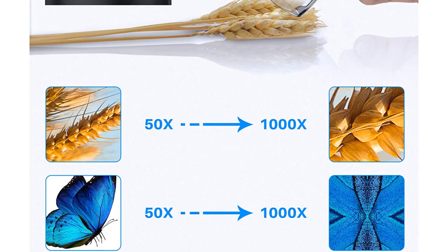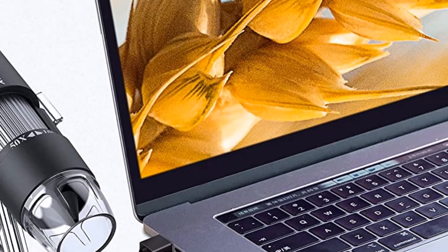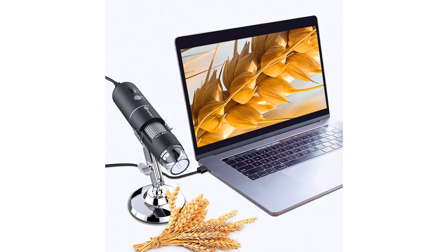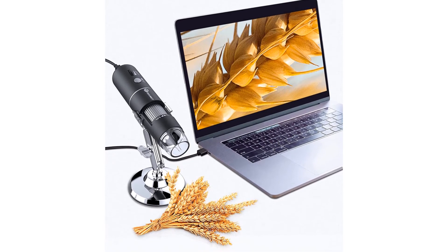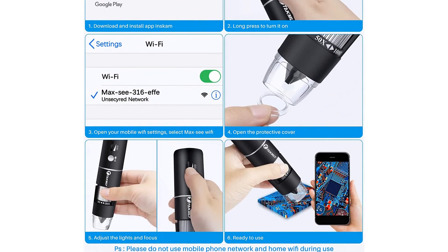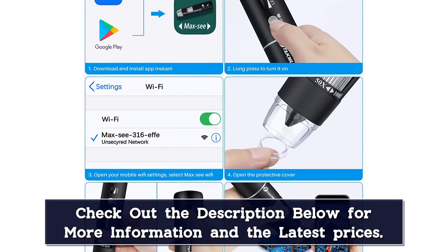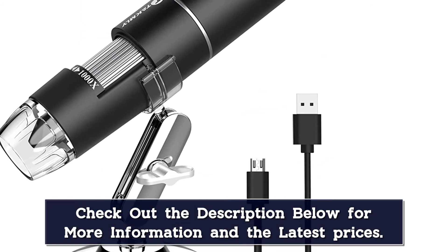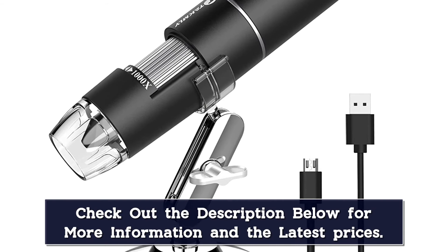Wi-Fi connection for phone: download the software from Google Play or App Store, turn on the microscope, connect the Wi-Fi (no password), run the app — easy to use. What you get: 1x microscope, 1x USB cable, 1x stand, 1x base, 1x user manual, and 24-hour professional after-sales service. For USB on Win 10/11, plug in and search camera in Windows. For Win 7/8, see the user manual. For MacBook, use Photo Booth or QuickTime Player. Note: disable the default laptop camera in Windows and change privacy settings to permit camera access.